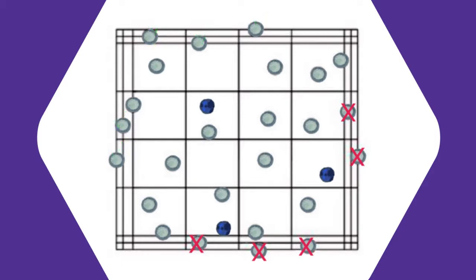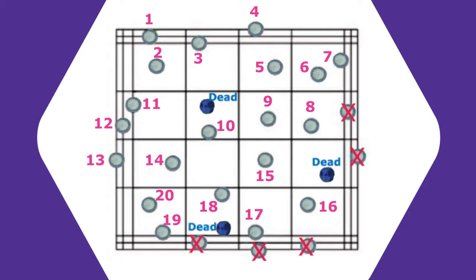Now we'll count the live and dead cells. In this example, we have 20 live cells. And based on Trypan Blue staining, we have three dead cells.